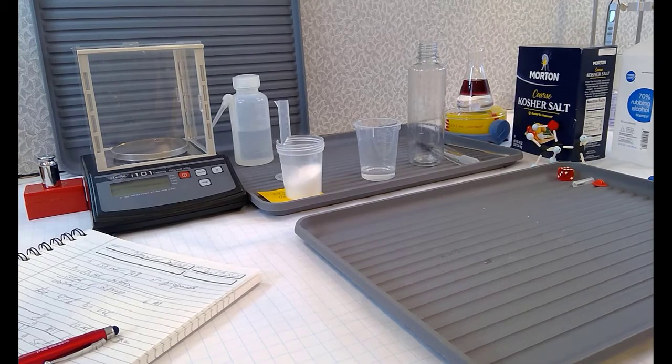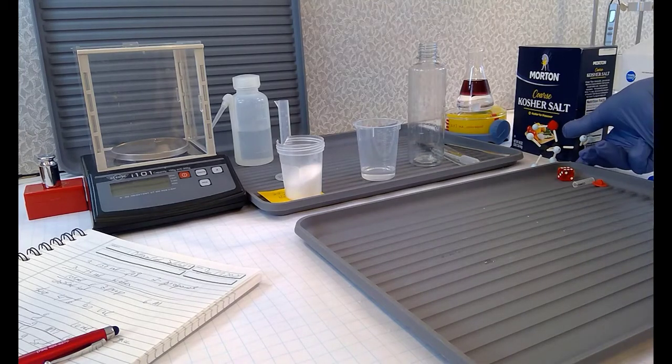Well, here we are again for another virtual lab. In this case, we're going to be dealing with rubbing alcohol and salt. Get this show on the road. We're going to start off by talking a little bit about the rubbing alcohol. 2-propanol is the official name.